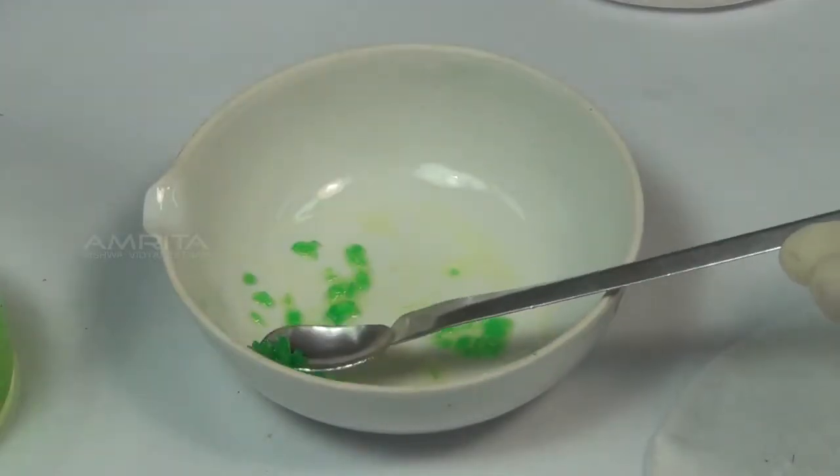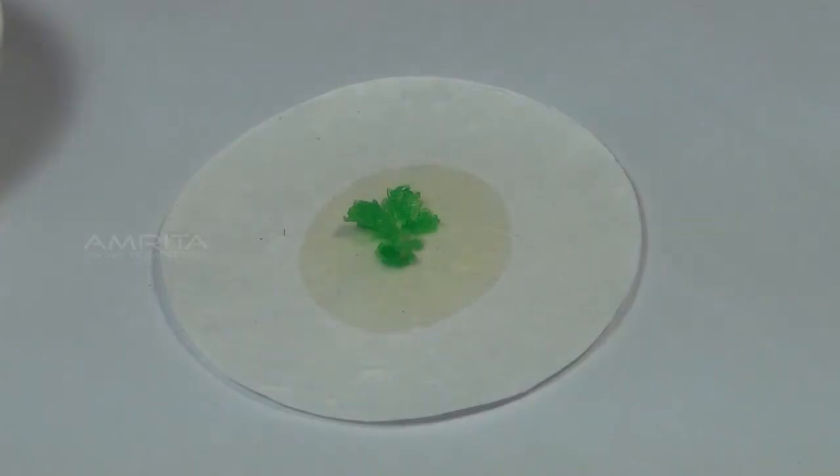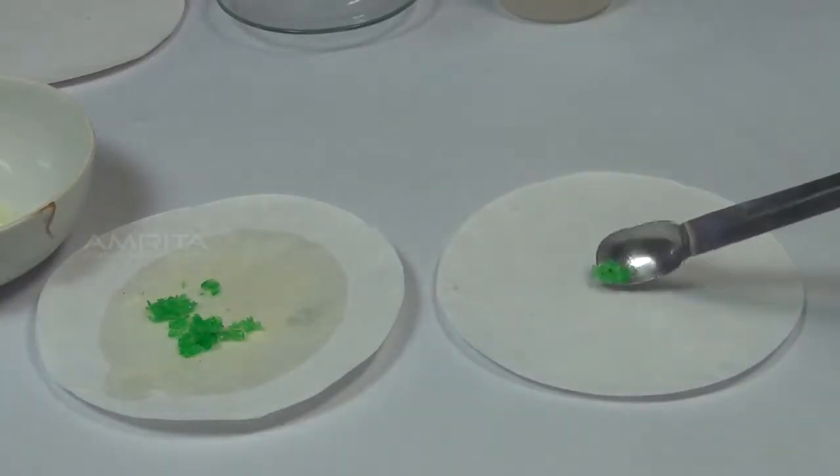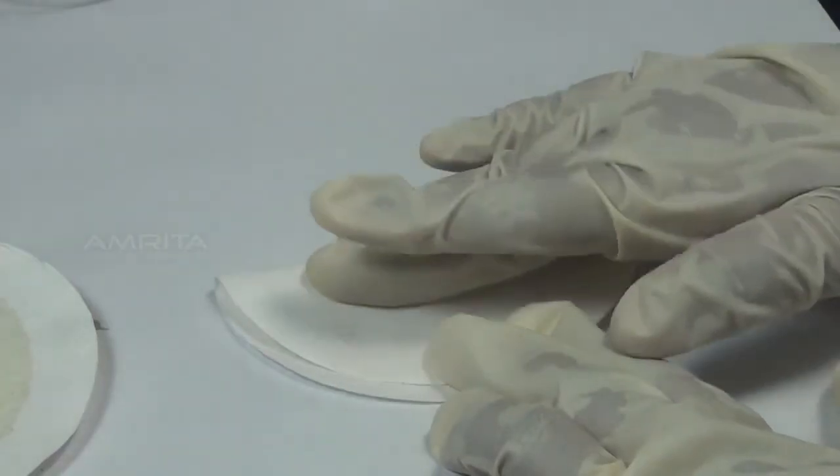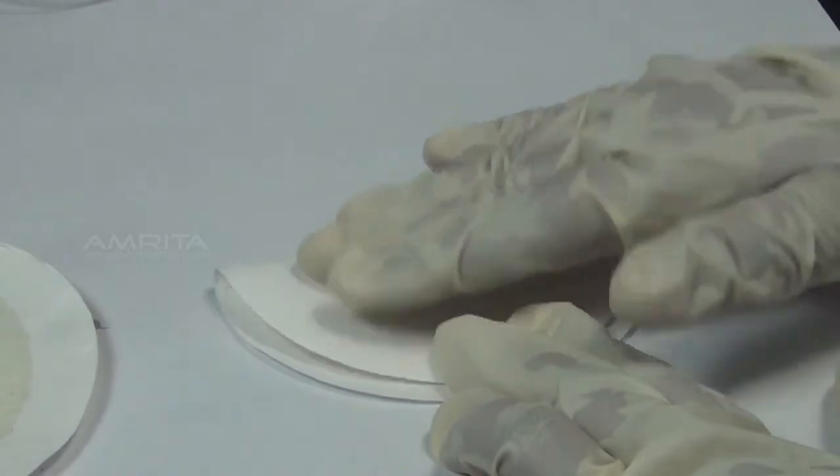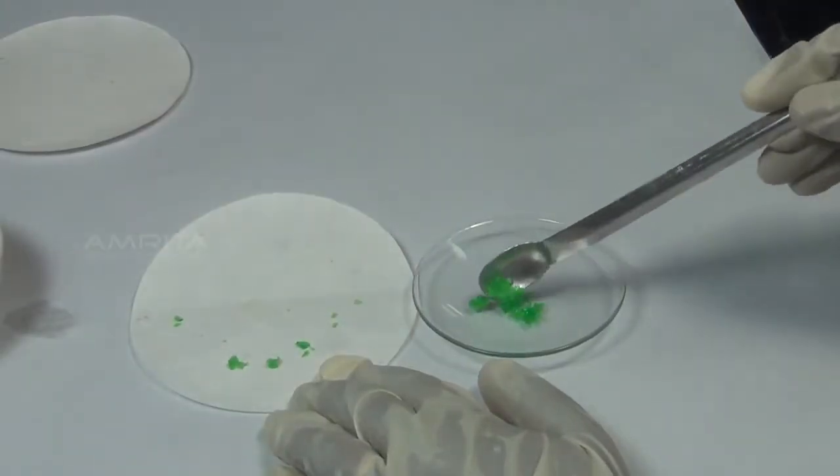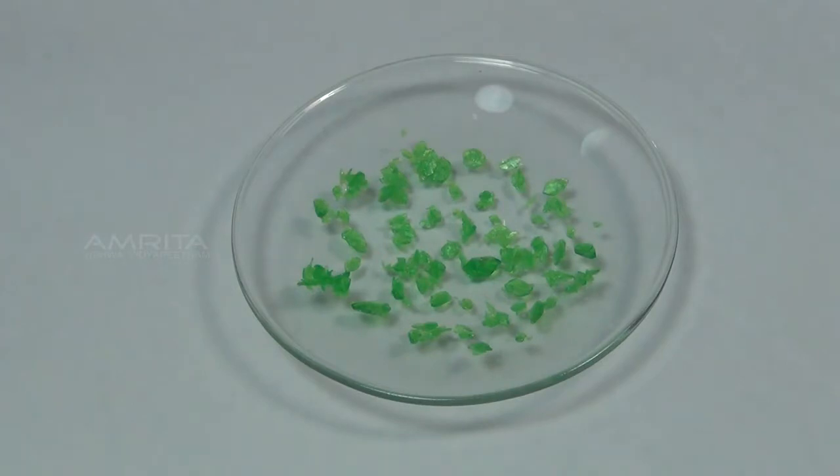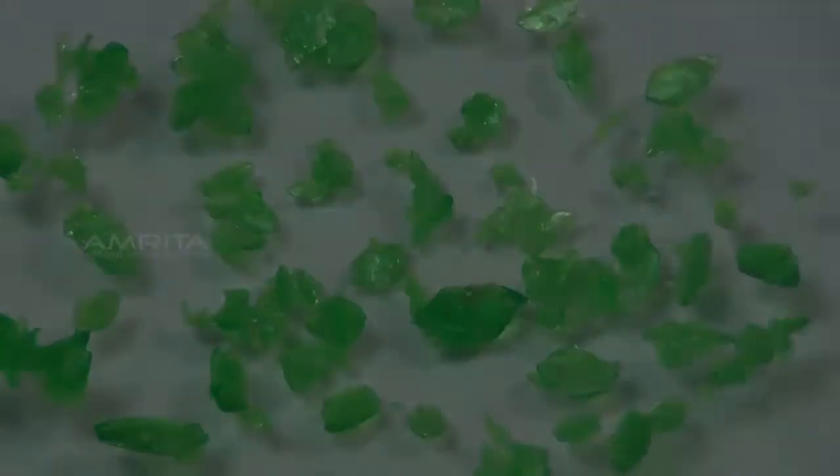Using a spatula, remove the crystals to a filter paper which soaks up the solution. Transfer the crystals to another filter paper and dry them by pressing gently between the folds of the filter paper. Now transfer the crystals into a watch glass. The crystals of pure potassium trioxalatoferrate-3 are emerald green in colour and are octahedral in shape.